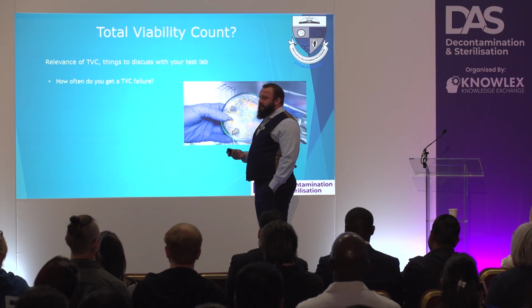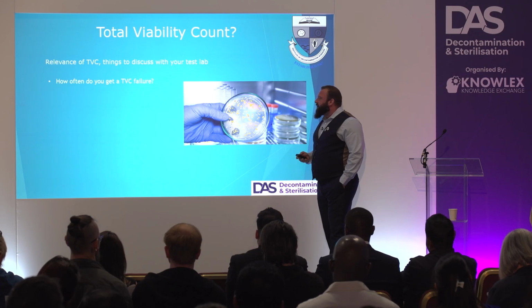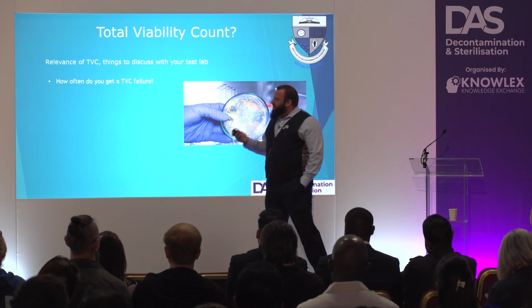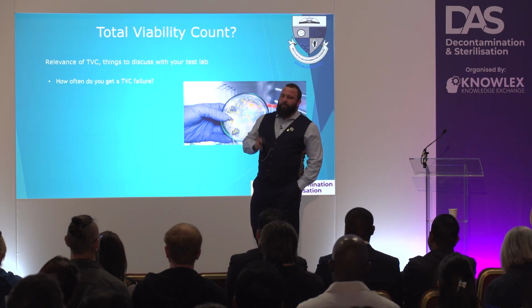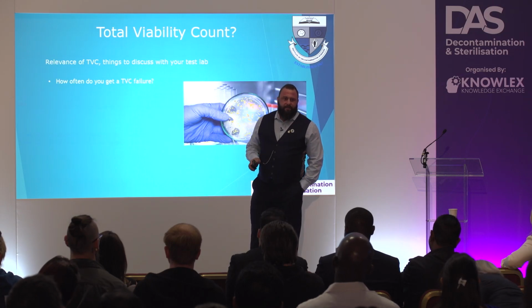Generally, you'll see an R2A agar or a tryptic soy TS agar. That's what's recommended in the A. The problem is, with the TVCs, we're all focused on water, and within water, we're all focused on Pseudomonas. But there's lots of other organisms that cause issues within endoscopy.